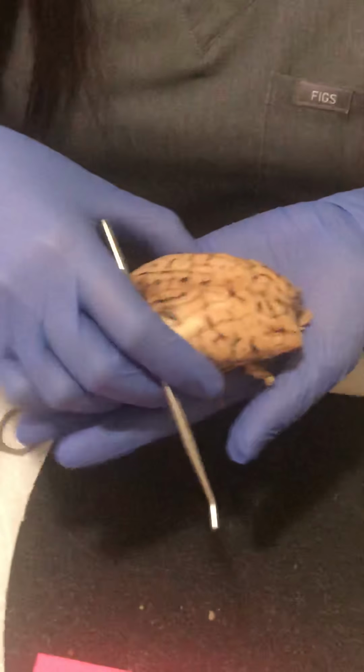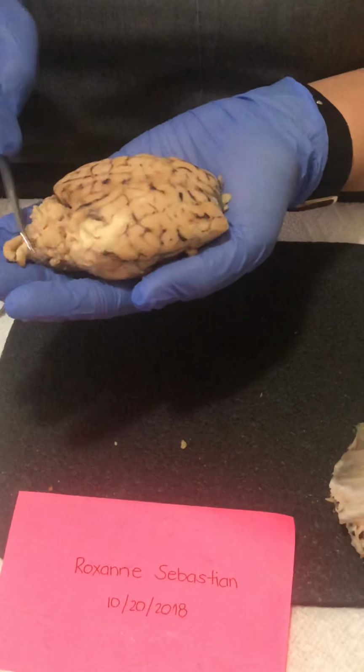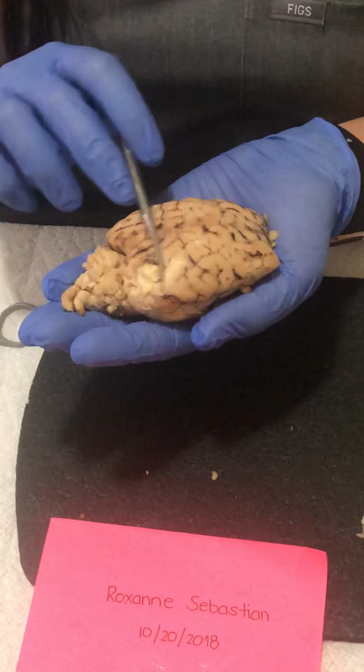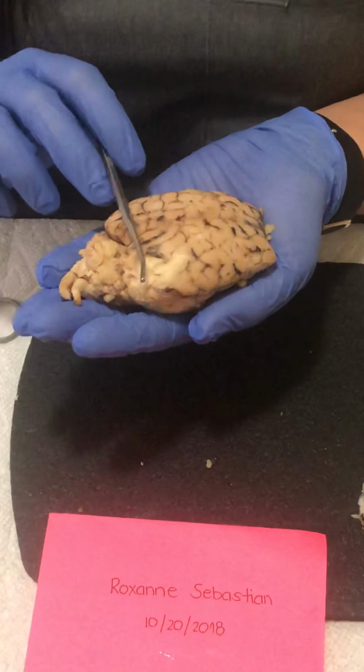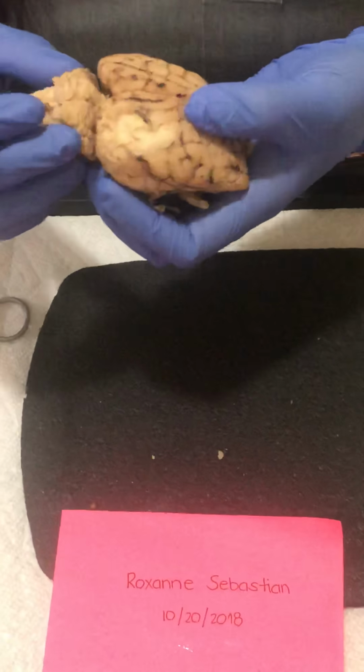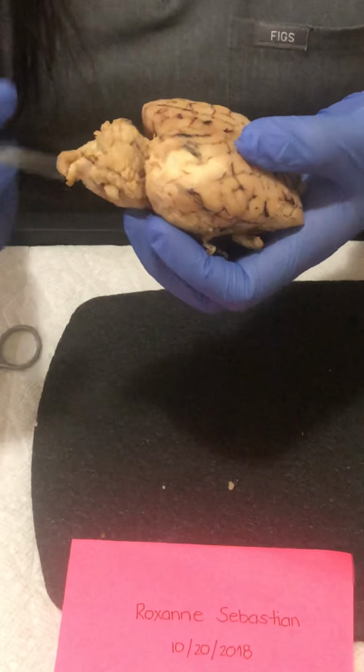This is the top view, or the dorsal view, and this part right here is your cerebrum, and this little brain right here is your cerebellum.